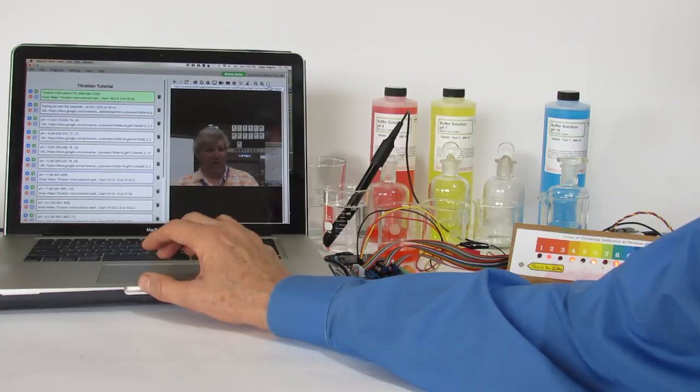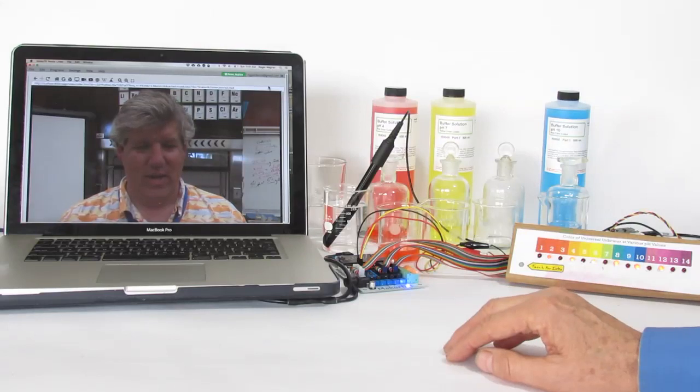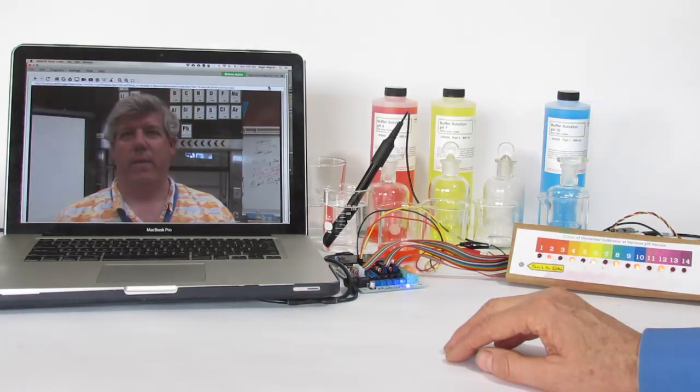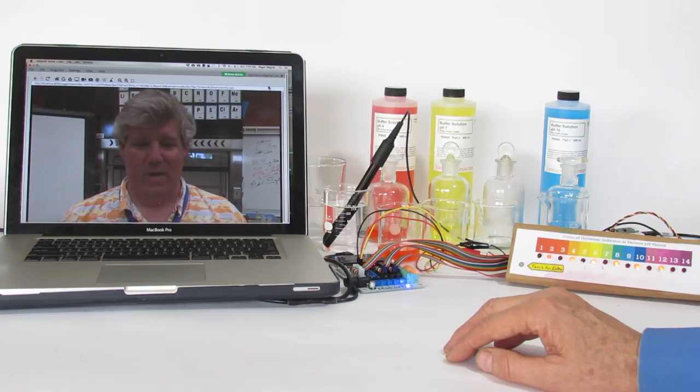Hello and welcome. Today we are going to have some fun doing some titrations. Currently you have an unknown acid in your beaker.